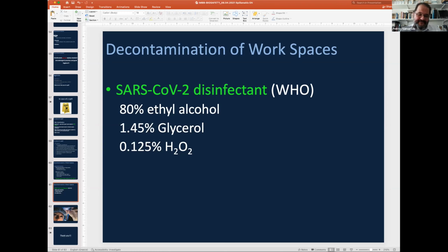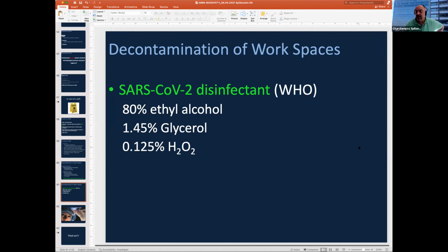Okay, thanks. Actually it's the most dangerous thing for creating a vaccine the traditional way, meaning to produce SARS-CoV-2 in large quantities, then kill it and then use it in a vaccine, because you need such laboratories to contain the living virus and not let it spread to either the personnel or outside, let's say, the factory that creates the vaccine. So that's the most difficult thing, to maintain such airborne transmitted microbes.